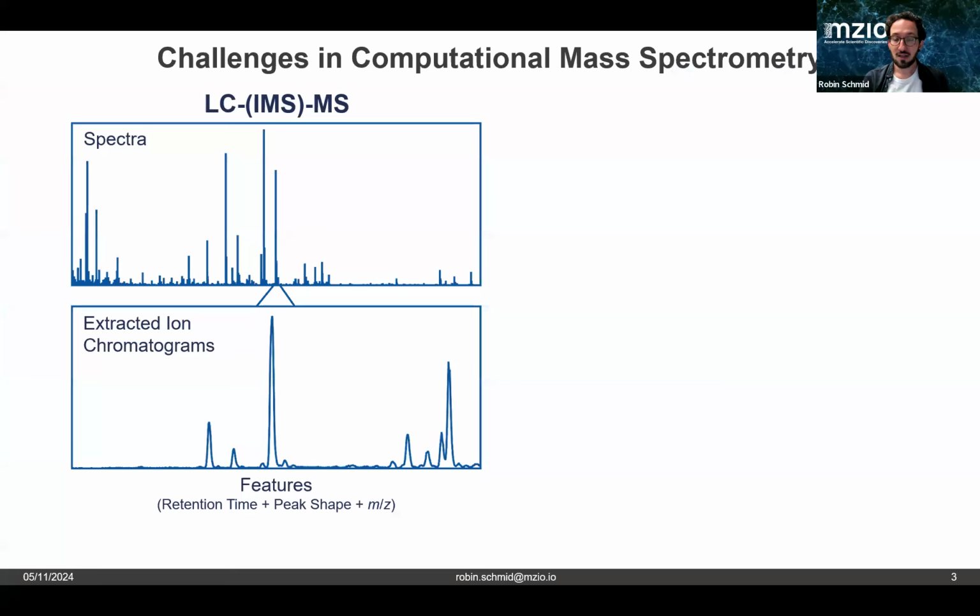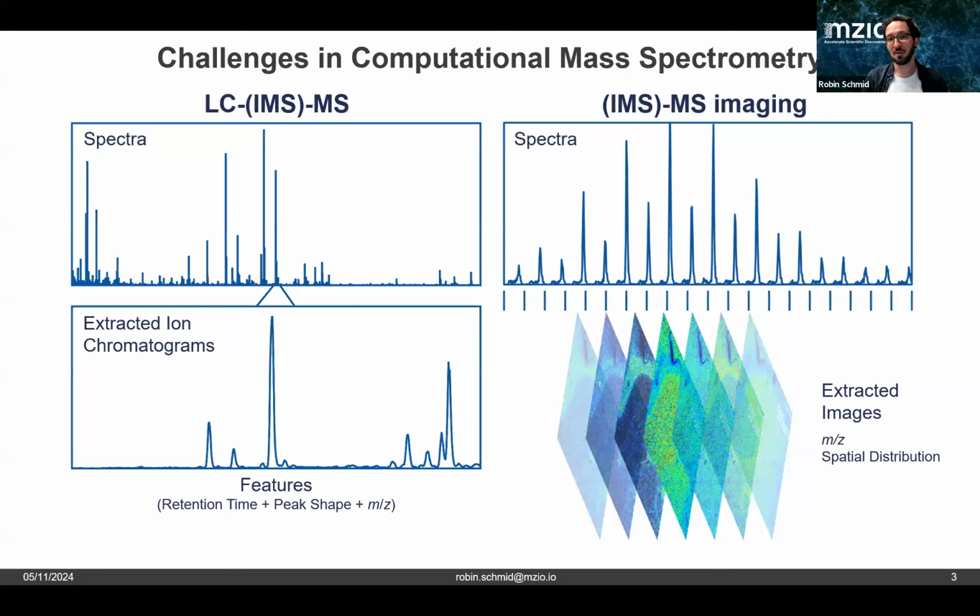And now, from the perspective of the issue that mzmine is trying to solve, of course, we focus on mass spectrometry. In mass spectrometry, we often hyphenate different instruments. So we're using, for example, LC, so chromatography, ion mobility spectrometry, maybe imaging, mass spectrometry imaging here. And honestly, in the end, it's all the same sort of detector. We're detecting the mass-to-charge ratio, and mzmine is using this and allowing you to process any kind of mass spec data in the same tool.